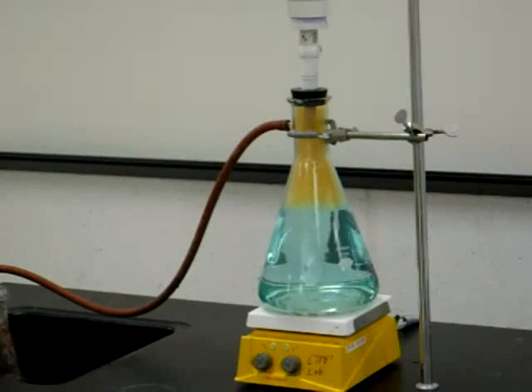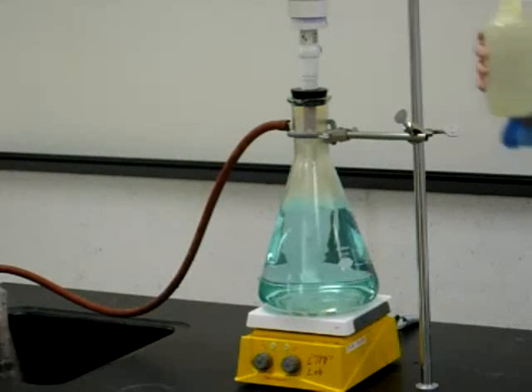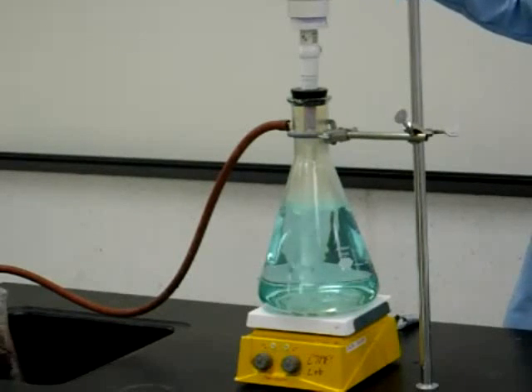We now see the solution's blue, and we're seeing a second form of copper. This is the copper-2 ion. To see additional forms of copper, we're now going to add ammonia. This ammonia is similar to the ammonia you would find in your house that is used for cleaning.